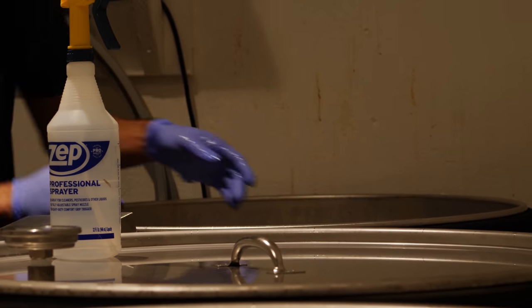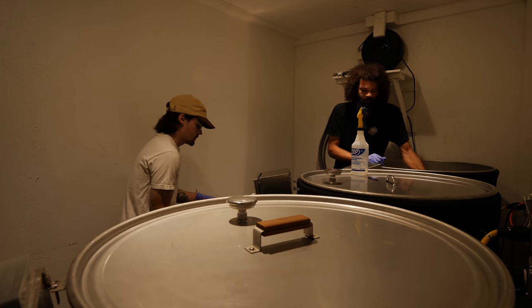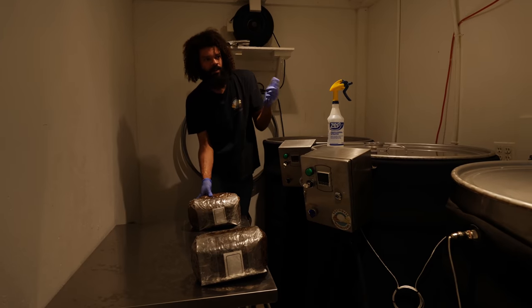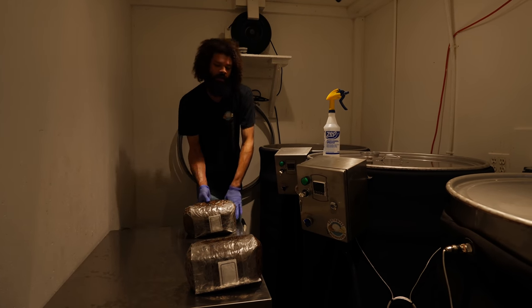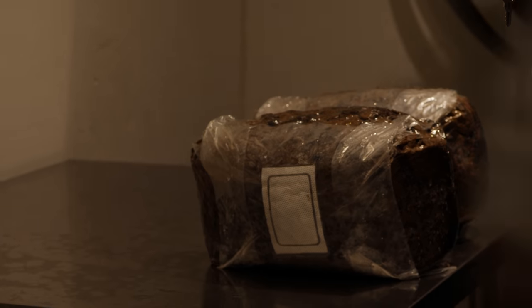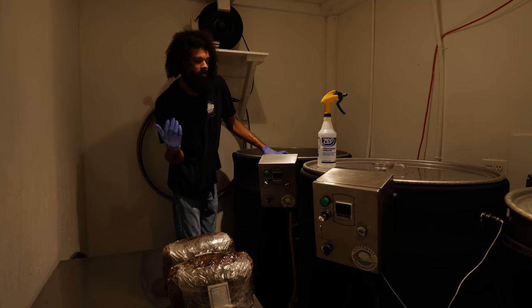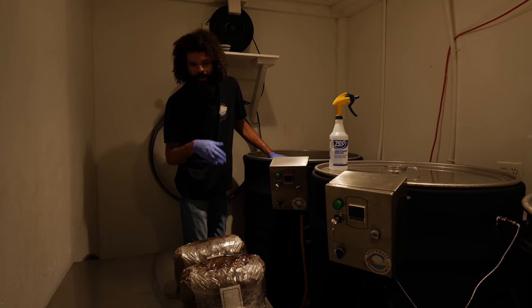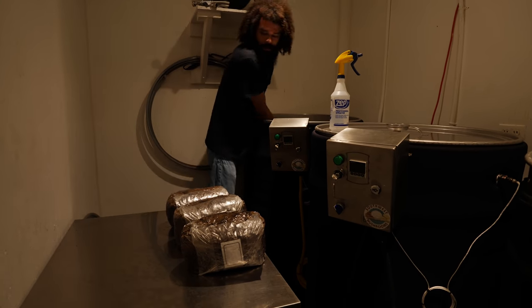These are all completely cooled down, so it's safe to unload them. This room connects to the lab, so the lab is pushing out positive pressure and HEPA-filtered air into this room. This is kind of like a secondary clean room. No outside dust or contaminants can get in. Positive pressure air is blowing through each crack and crevice within this room and underneath the door, so that helps out and I never have any issues.